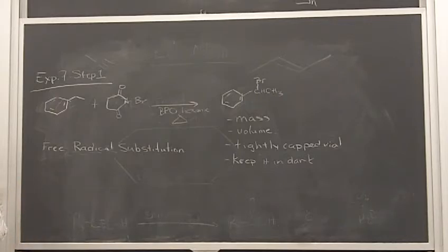Make sure you make observations of what that product looks like, because what you end up having next week in that vial may look different than what you've got this week, because it may change just on its own in a week, okay? Which is fine, but make sure you note what it looked like this week versus what happens next week. It may start turning colors on you. There may be things that form in the vial. All sorts of things can happen because this is so reactive.